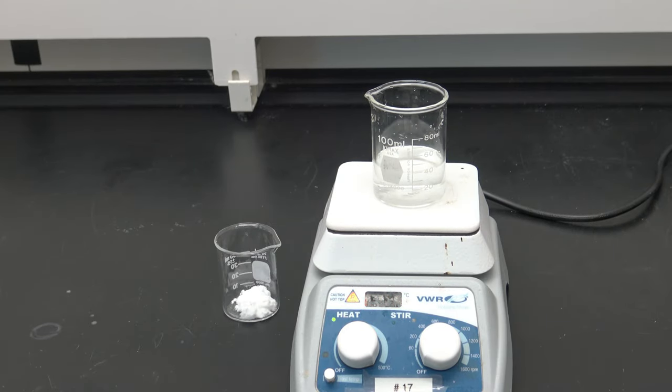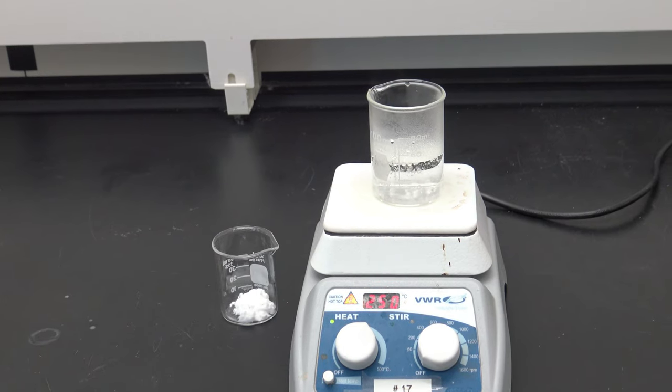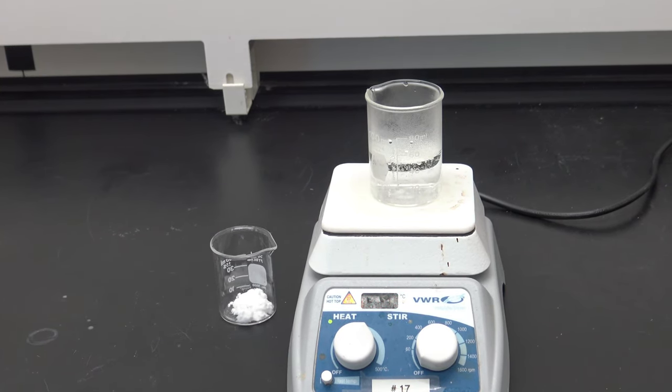I scraped the solid salicylic acid out of my Buchner funnel and put it into a beaker, and I'm now going to recrystallize it in boiling water. I've calculated the minimum amount of water required to recrystallize the salicylic acid that we've isolated, and I need approximately 4.2 milliliters of boiling water.